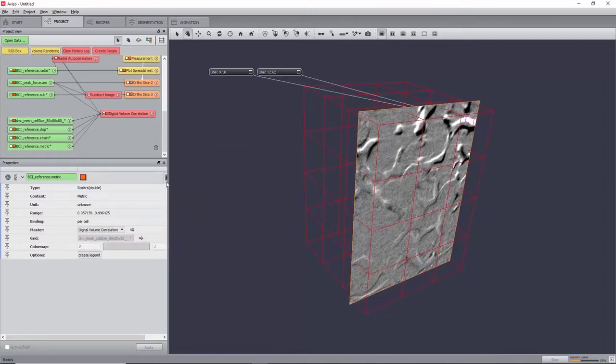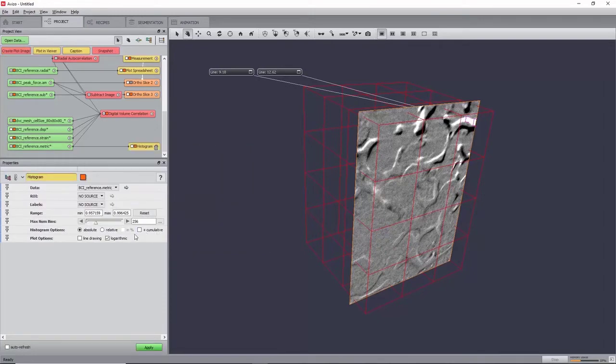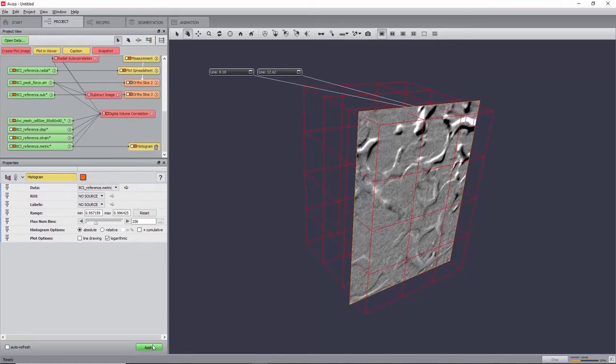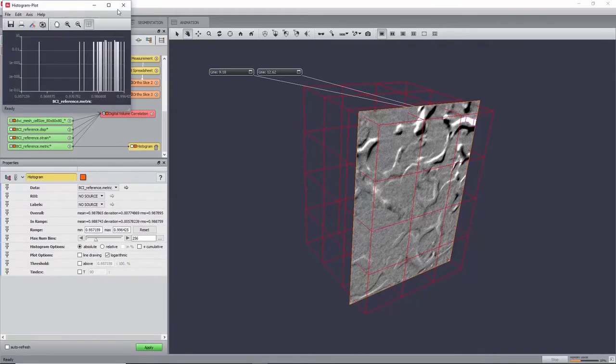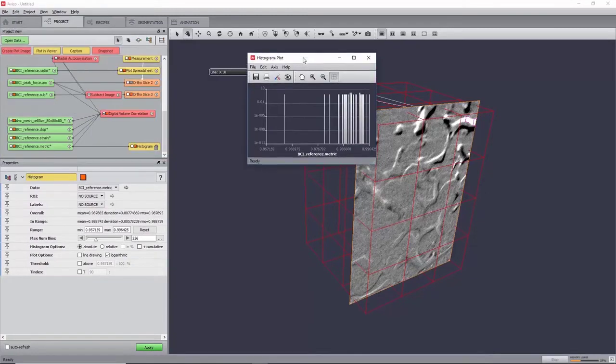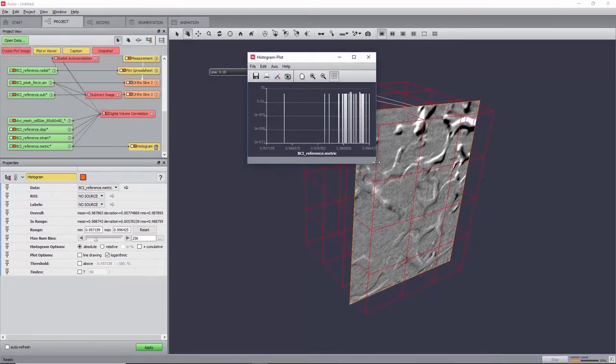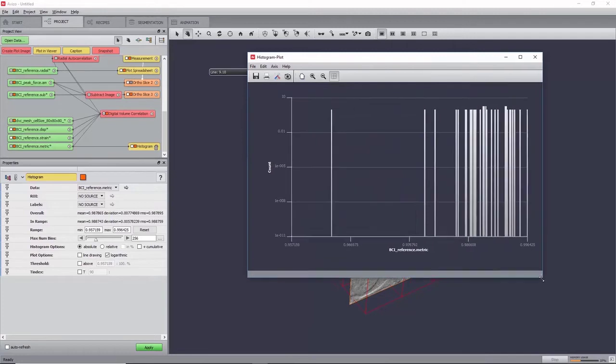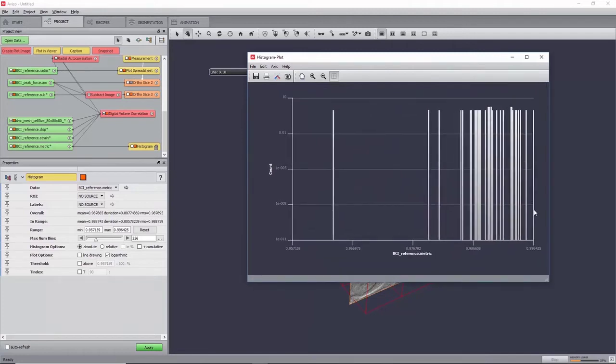When clicking Apply with default parameters, you will see a frequency plot of the metric map. We can see that all the metrics are superior to 0.95, which indicates a good correlation.